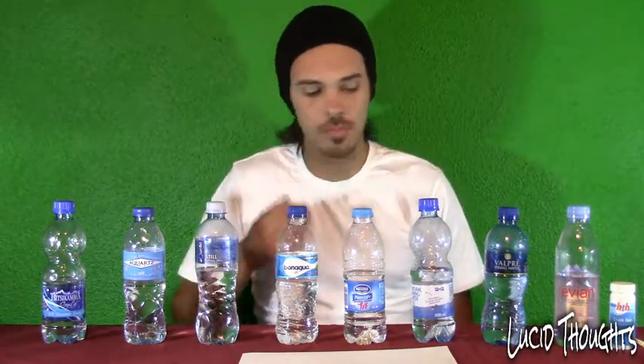Welcome to Lucid Thoughts. I'm testing water. Since Cape Town, we've been struggling with water for the last few months, and most people decided to rather drink bottled water and stay away from tap water. We might be surprised that some bottled water could actually be dangerous for us to drink as well.